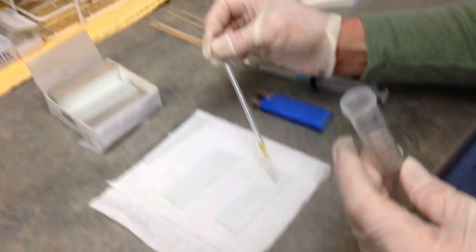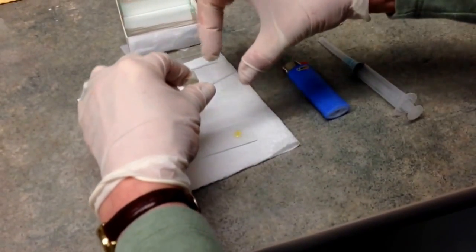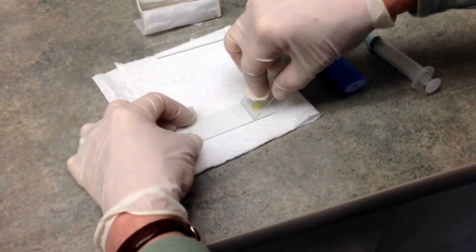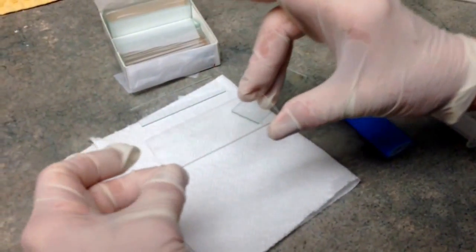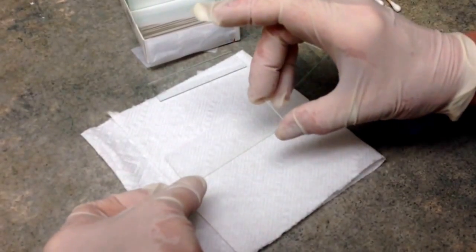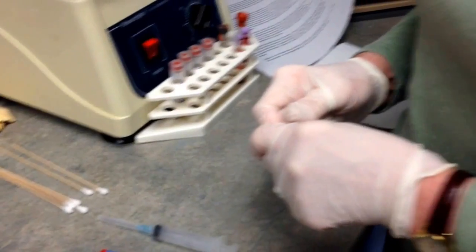Take a little bit of the re-suspended sample and place it on the end of your slide. Take a second clean slide at about a 70 degree angle, with your thumb and middle finger on either side and your index finger on top. Place it right in front of your drop, draw it back, let it spread across the slide, and then just push it along. It doesn't have to look as neat as a blood smear. The liquid should be evenly distributed over the slide. Set it aside safely and allow it to dry. Make three or four of those — you want as many as you possibly can.